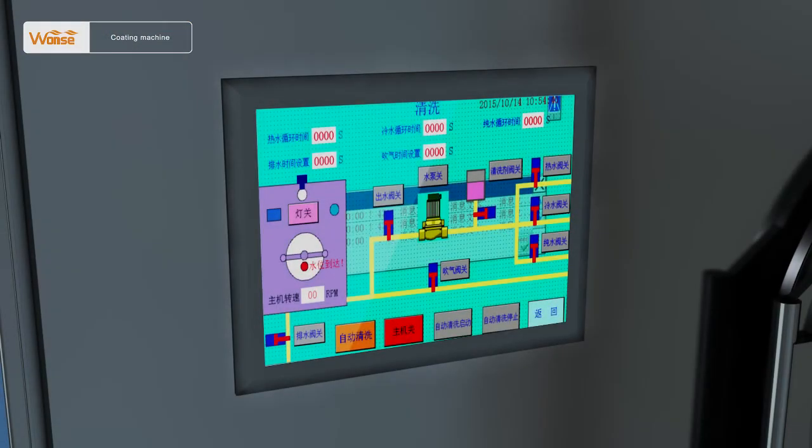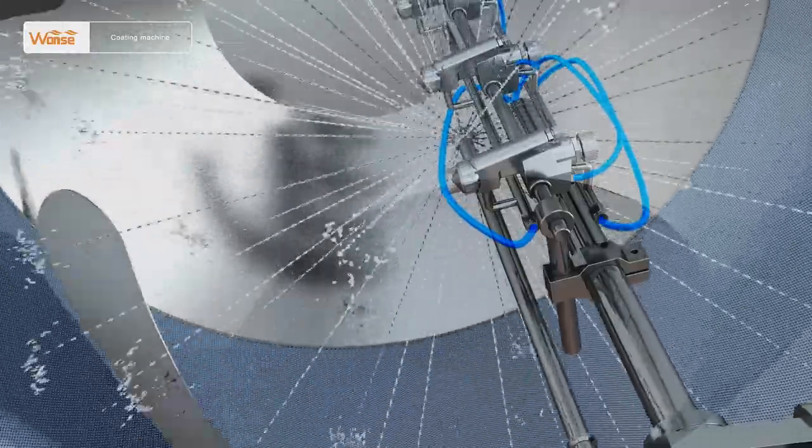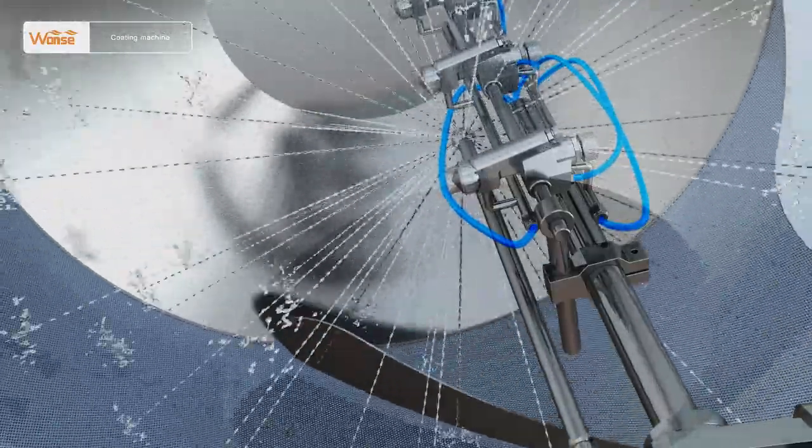CIP cleaning system operation. First, after entering the cleaning interface, open the drain valve of the washing liquid cleaning tank. Start the cleaning water valve of high pressure pump and the corresponding water output valve to carry out automatic cleaning with clean water.